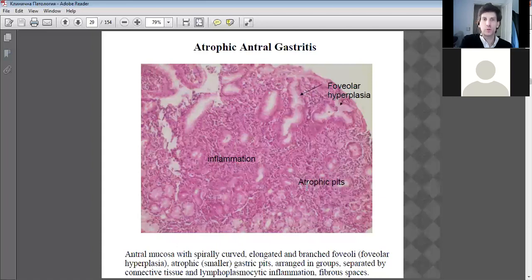With time, of course, if it's an ulcer, you get lots of fibrous tissue accumulating. So to try and it grows around the lesion, if you like. The fibrous tissue is beginning to form up this side here. Perhaps we can look at this area in terms of the magnification. This fibrous tissue is starting to form in this area. If we had differential staining, we could see the different types of tissue as well.